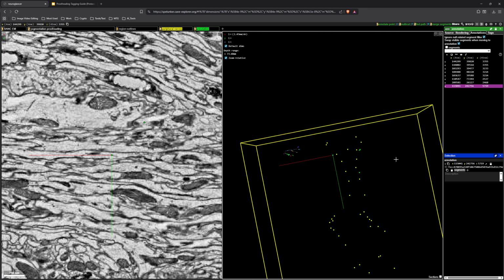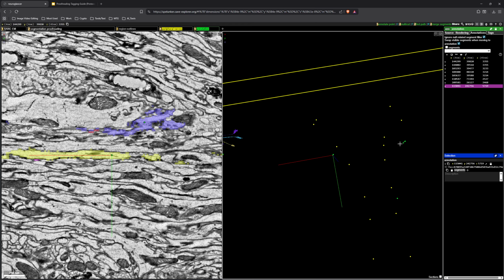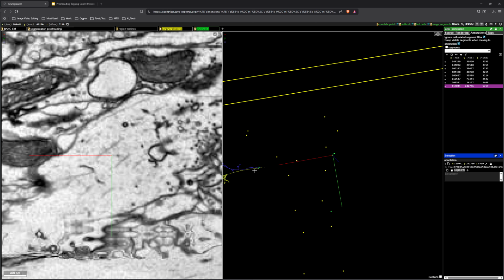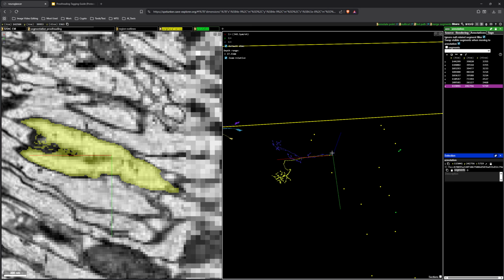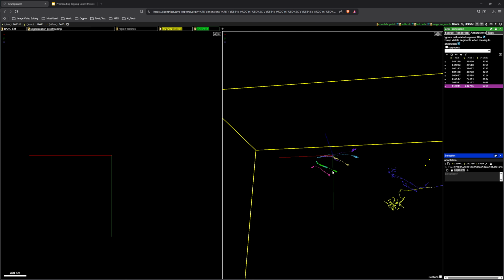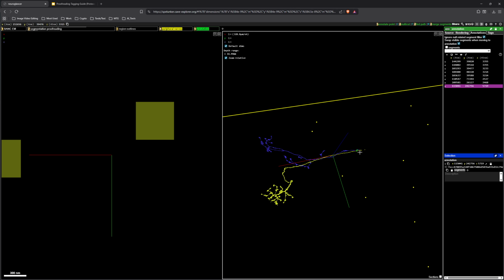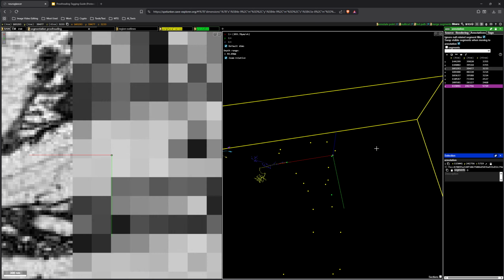Okay, so just to wrap it up, things like these two and this one over here that go into the central tear, these are ripped areas, but they are not marked backbone proofread. Things that leave the data set, like these here in the optic lobe or the other larger ones that we looked at earlier, those do get the backbone proofread label.